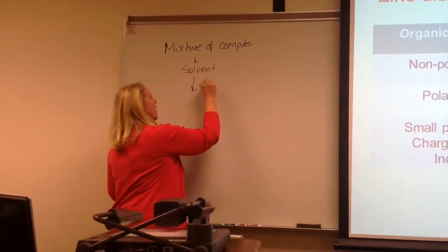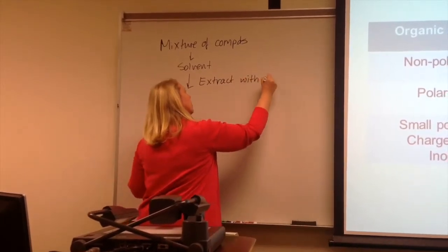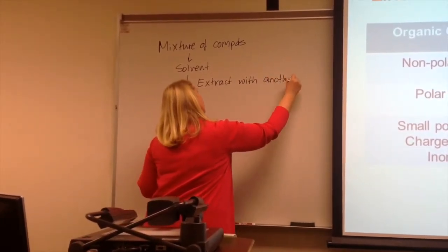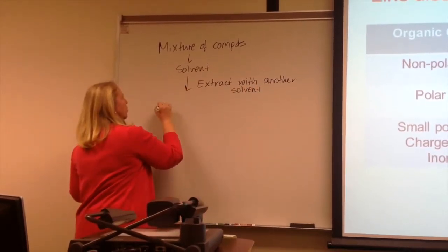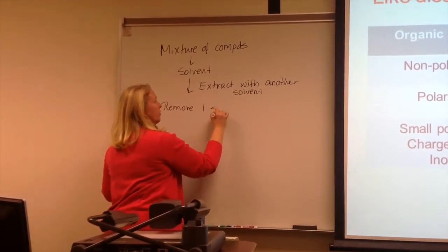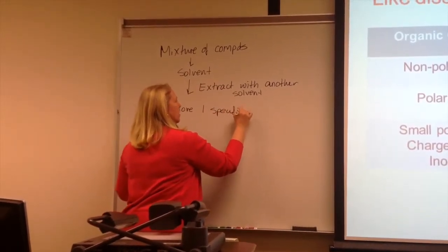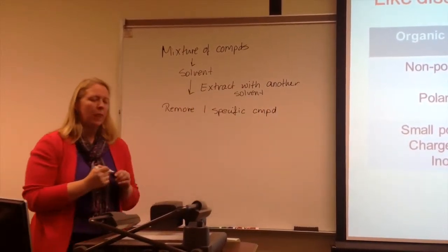So this is where the extraction part comes in. We're going to add another solvent to this and remove, hopefully, just one specific compound from that mixture.